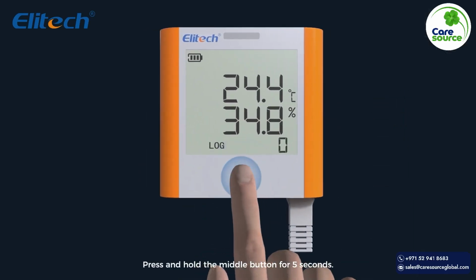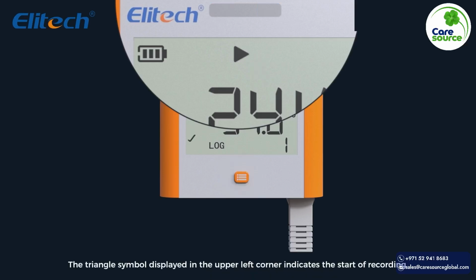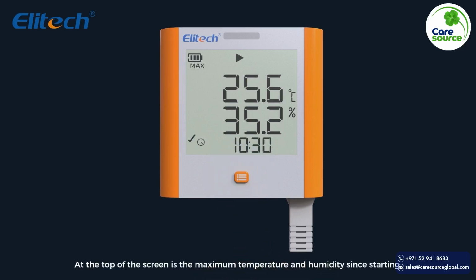Start using it by unplugging it from the computer. Press and hold the middle button for 5 seconds to start recording. The triangle symbol displayed in the upper left corner indicates the start of recording. At the bottom of the screen is the number of data entries recorded since starting. Short press the button. At the top of the screen is the maximum temperature and humidity since starting.